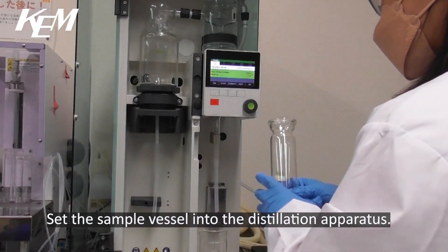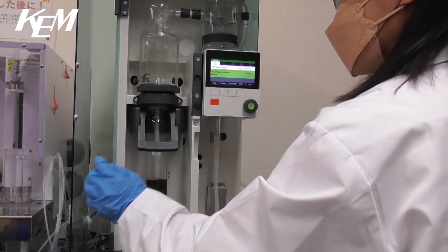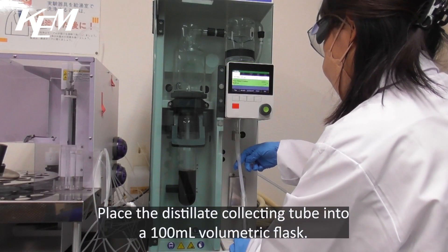Set the sample vessel into the distillation apparatus. Place the distillate collecting tube into a 100ml volumetric flask.